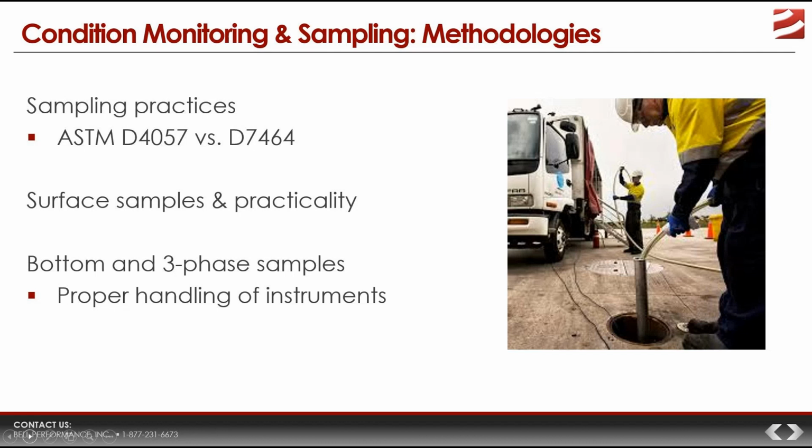Best practices for collecting these samples is, first of all, put samples in unused bottles, and then before you collect the next sample, you need to rinse your sampler and all those other transfer tools in alcohol. That's at least 70% alcohol by content. You do that in between each sample collected. And if you're using a funnel to transfer fluids, you especially want to make sure that it is sterilized.